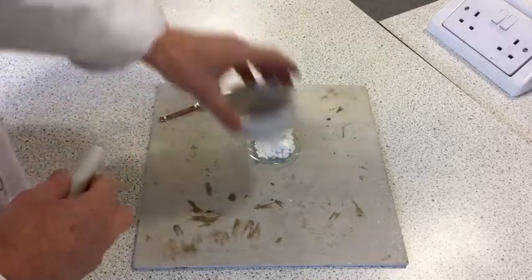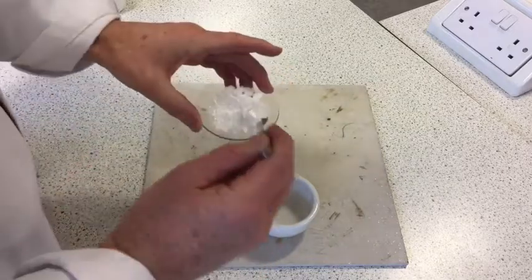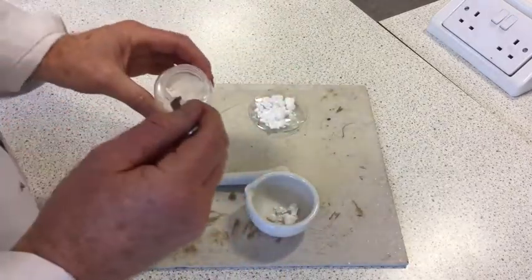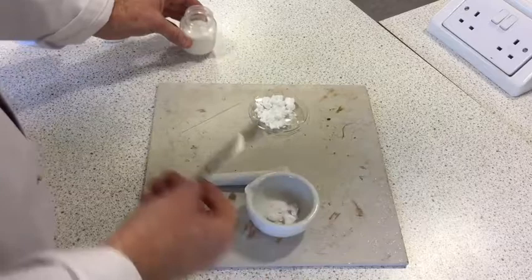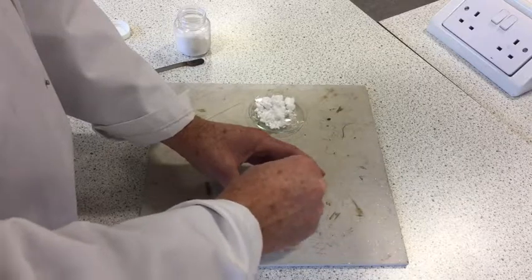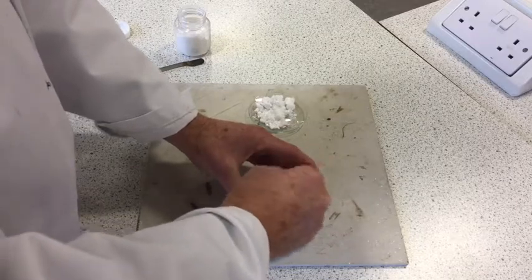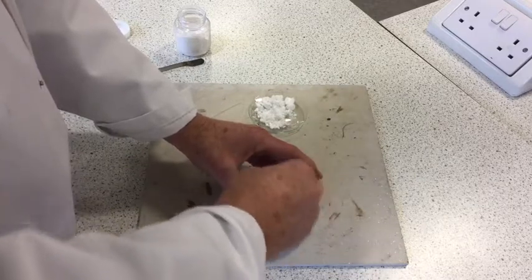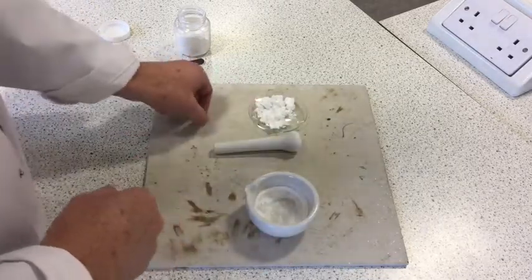The mixed melting point analysis involves mixing together equal quantities of your benzoic acid that you've prepared and some pure benzoic acid. The 50-50 mixture doesn't need to be exact — roughly one spatula of each. We'll then grind them up for a minute, making sure the mortar and pestle are clean, so we've got a homogeneous mix of the two samples. Then we carry out another melting point analysis, which in this case is called a mixed melting point analysis.